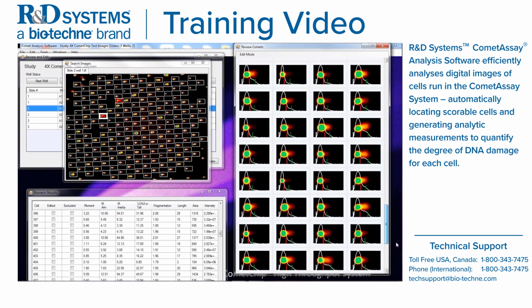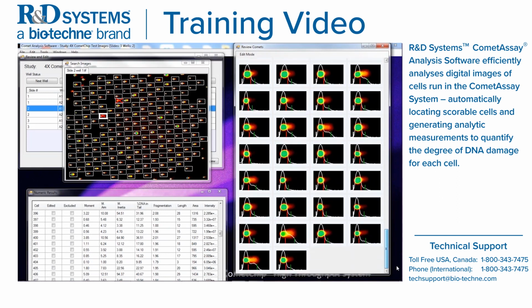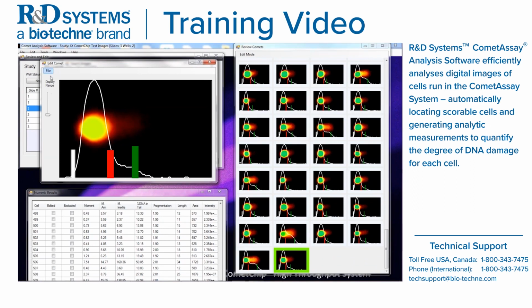And let's look at one. Maybe I question whether or not how it called the tail. Let's see. These look pretty good, but let's go ahead and select this. If I want to move the markers, you cannot move the markers in the review comet.